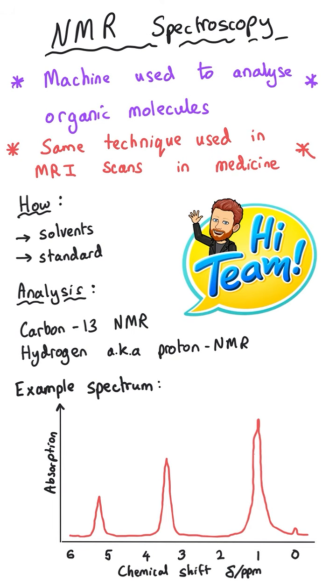Hello and welcome to this A-level chemistry explanation video where we're going to be taking a look at NMR spectroscopy. This is the instrumental technique that's used to analyse organic molecules, and it's actually the same technique that is used in MRI scans in diagnostic medicine. The video will focus on how this NMR spectrum is generated, but also how we can build together the different parts of a puzzle that we can use to identify an unknown substance as a result of our analysis.